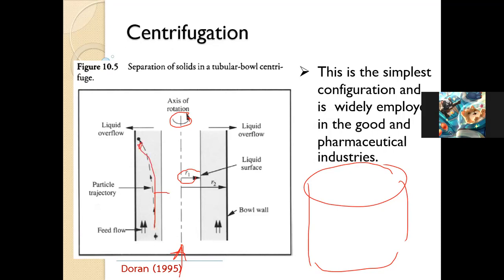For that case, you can collect the solid on the surface of the wall. Sometimes it's also due to the gravity force, the solid settling down. You can collect the liquid and solid by centrifugation. It is due to the centrifugation force.